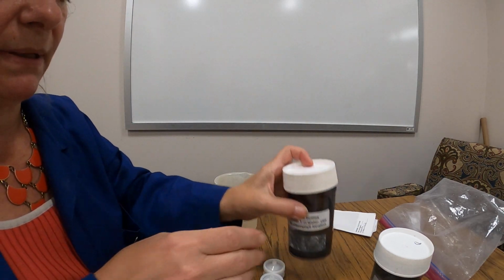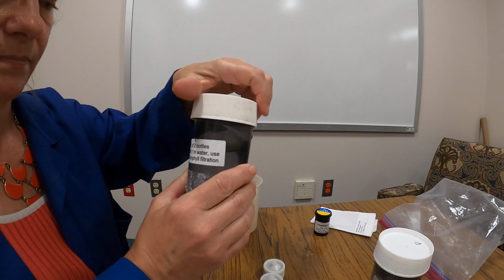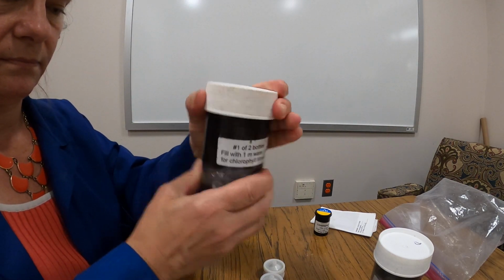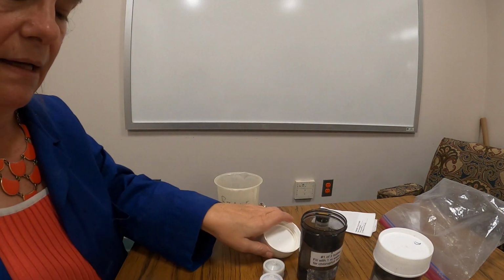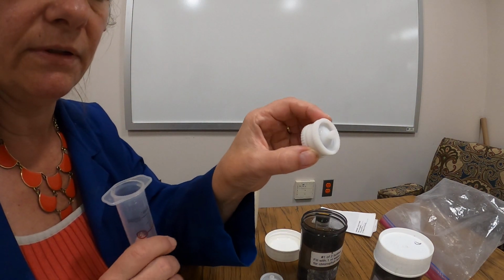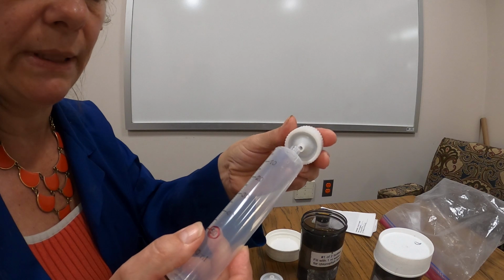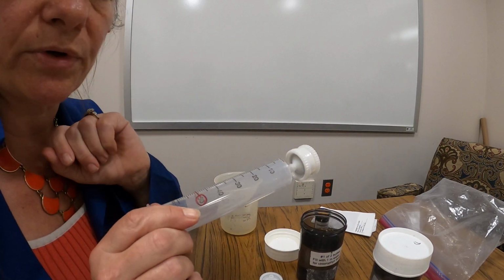Now I'm going to cap my bottle again. And I'm going to make sure I mix my sample. And now I'm going to put my filter holder on my syringe. And what's nice with these filter holders is you can't do it the wrong way. It's only going to fit one way. And I'm just going to push that, and I just give it a little quarter turn just to make sure it's on there snugly.